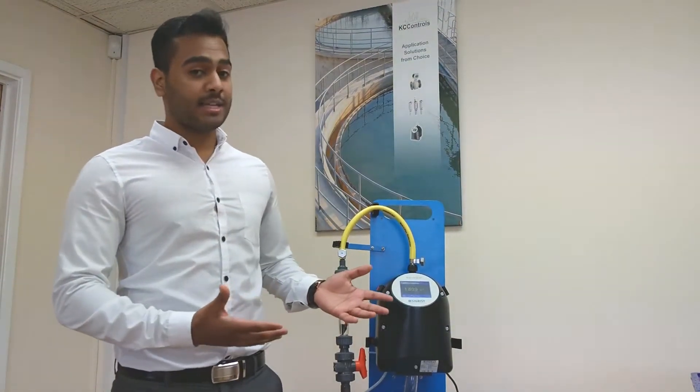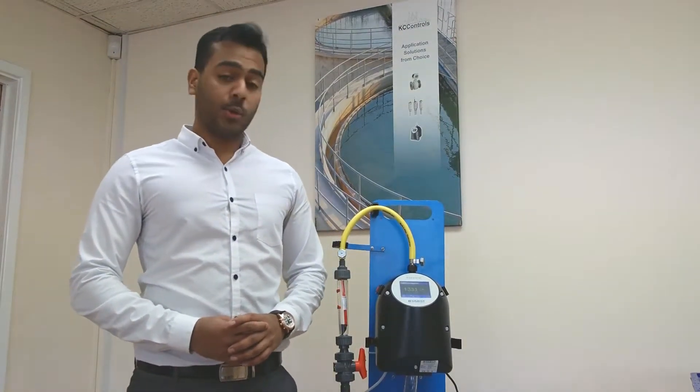Hi, I'm Stefan Joseph at KC Controls and today I'm going to introduce the Sigrist WTM Turbidity Meter. It has many features but today I'll be talking about two: self-calibration and non-contact measurement, which saves you both time and money.